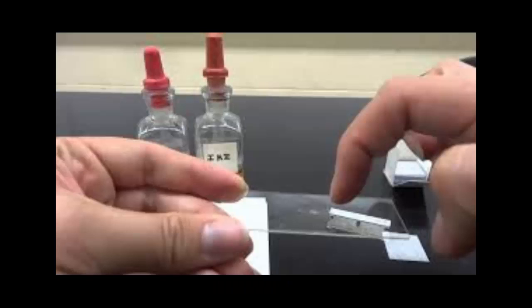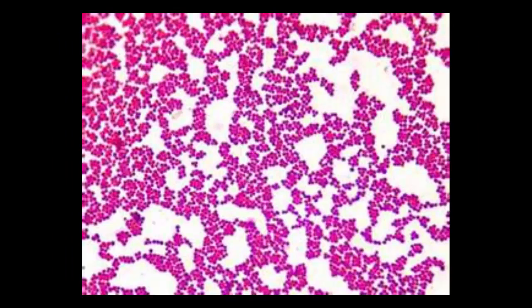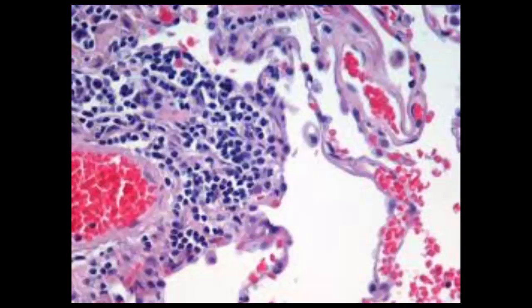Because light needs to pass through the specimen, it must be very thin and transparent. Light microscopes can magnify effectively to about 1,000 times the size of the actual specimen. Biologists use various techniques to enhance the contrast and enable cell components to be stained or labeled.